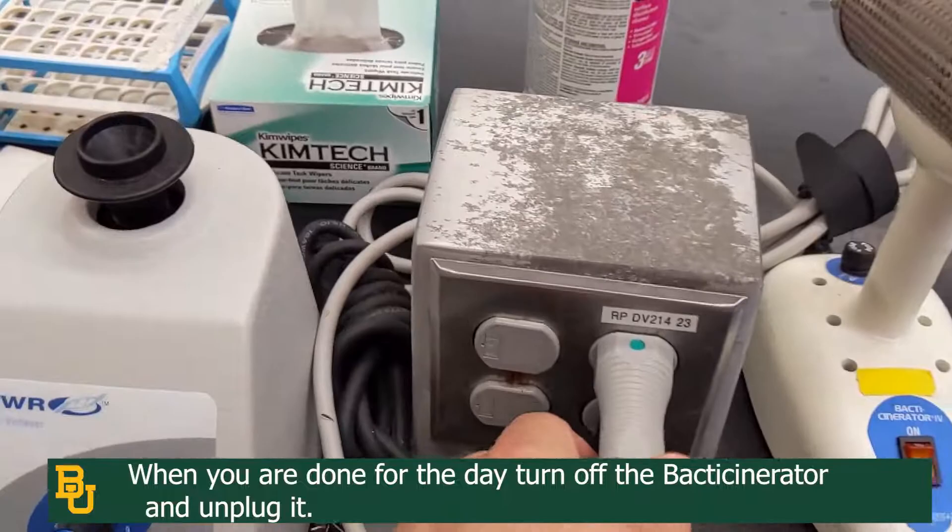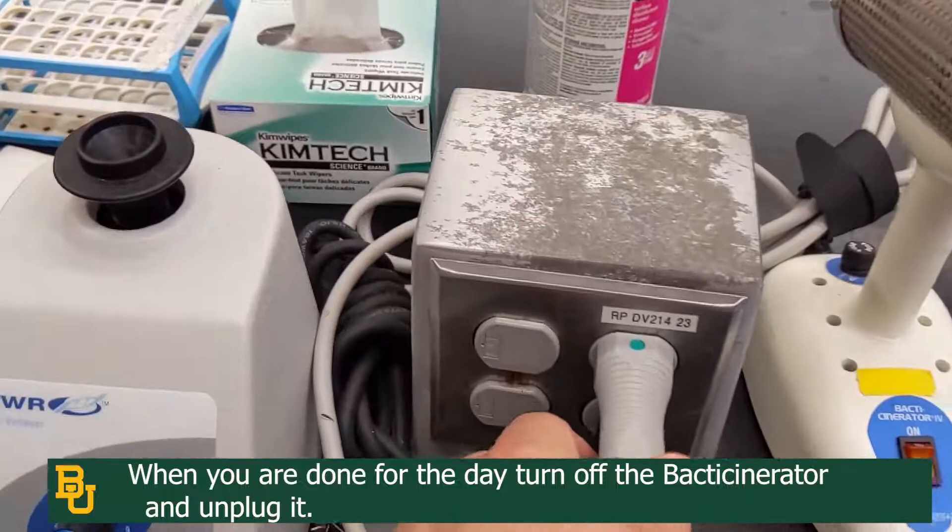Once you are done, please flip off the back decinerator and unplug it every time you are done with it, and reset it to its original position. Thank you.